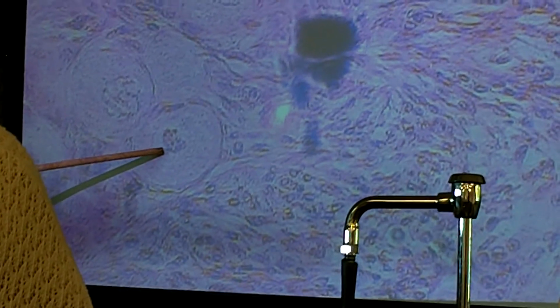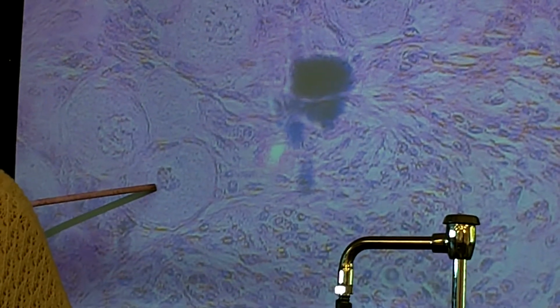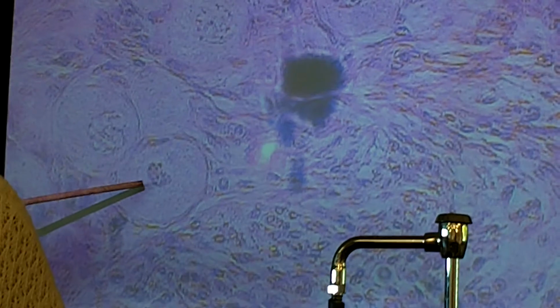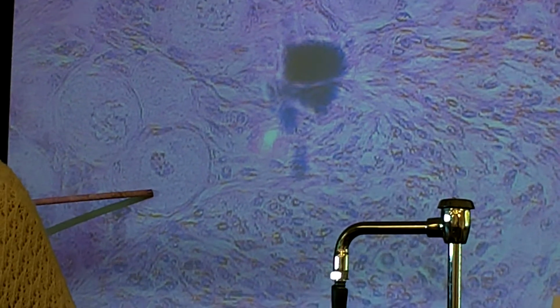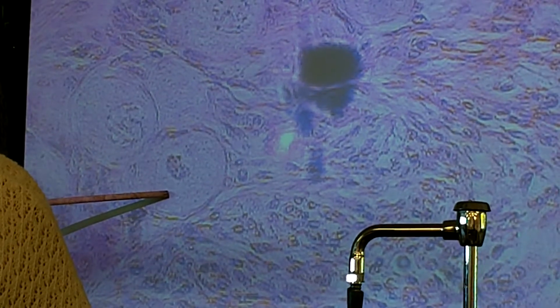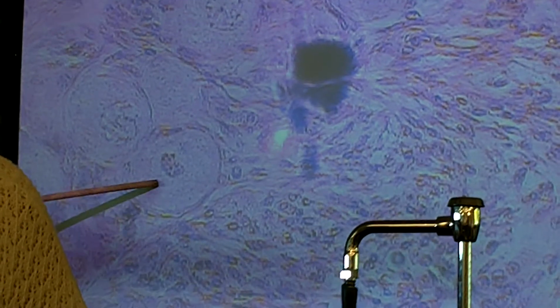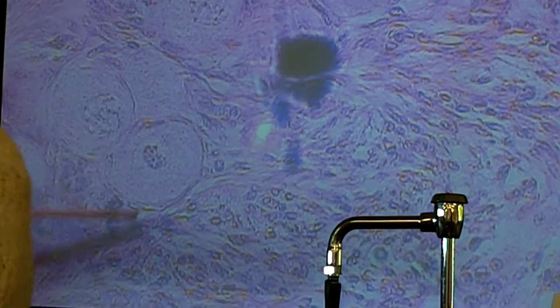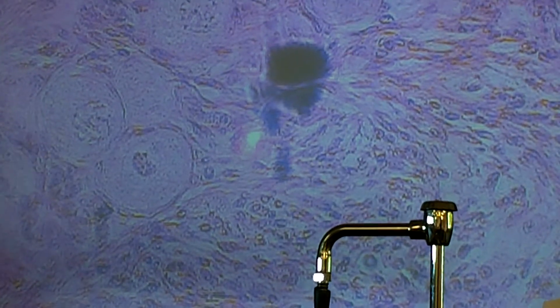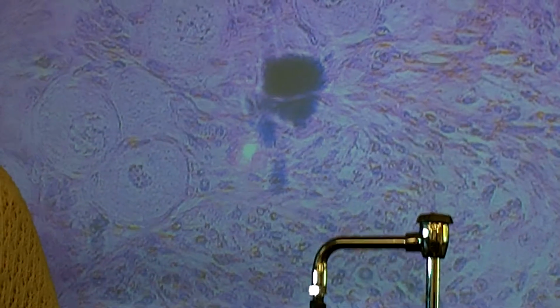If we point it here and say, what's the specific cell? Oocyte. But if we said, what is the structure that includes not only what the pointer is touching, but the cells that are surrounding it? What's that overall structure? Primordial follicle. Or we could phrase it, name the stage of follicular development. That's a hint, if you've ever heard one, right? Oh, I must be looking at ovary. Primordial. So there are several different ways we'll get at how to ask the question. So those are primordial follicles.